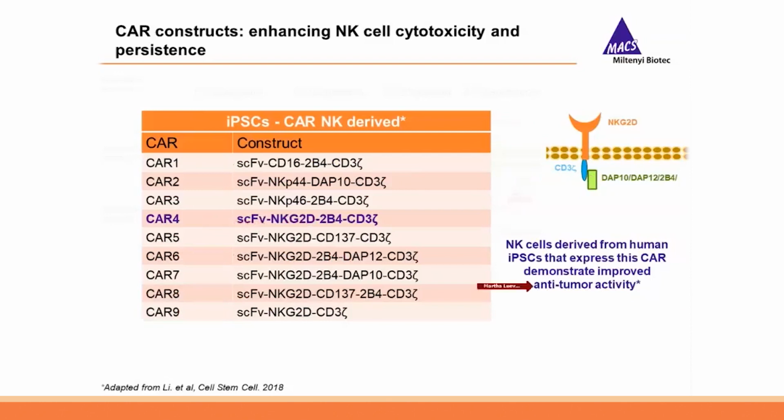So this is just an example of how in the future CAR-NK cells might be different from the CAR T cell constructions, and it makes sense because CAR-NK cells are different cell subtypes and have different ways of being activated.